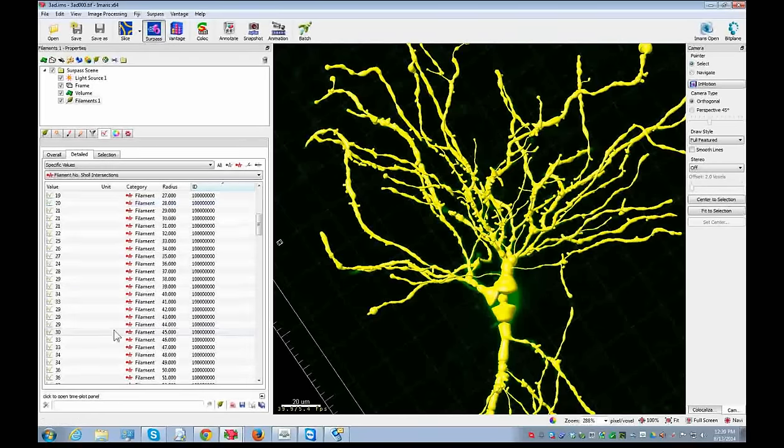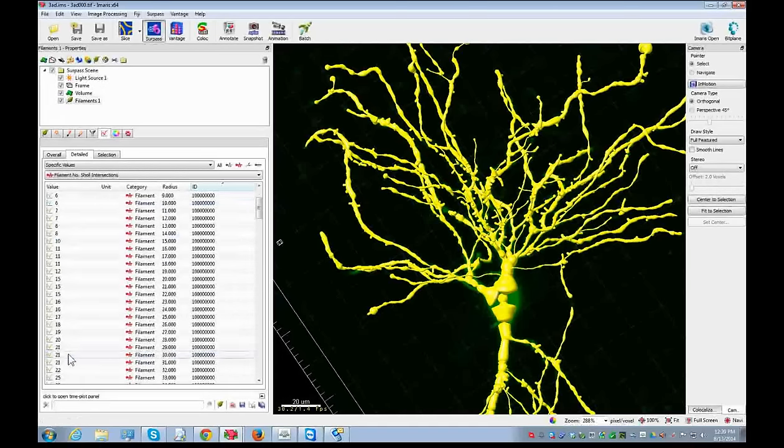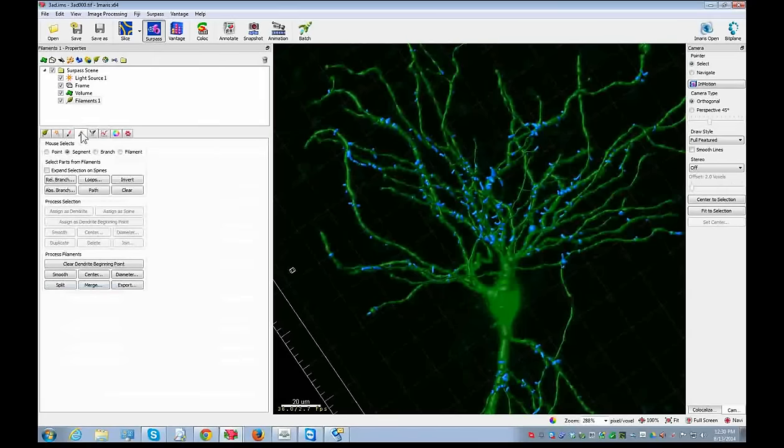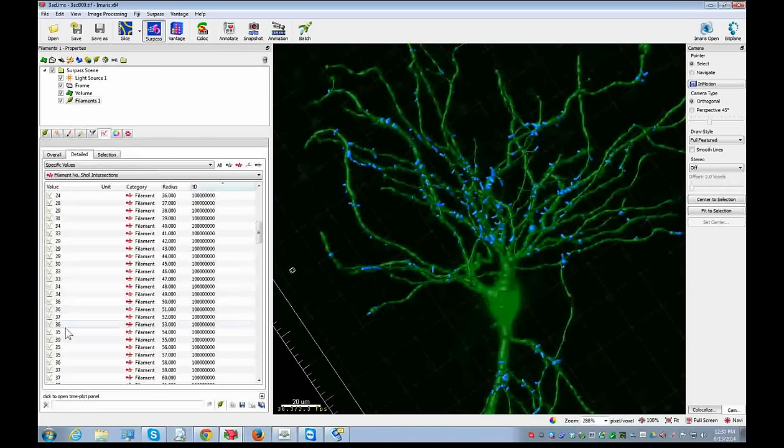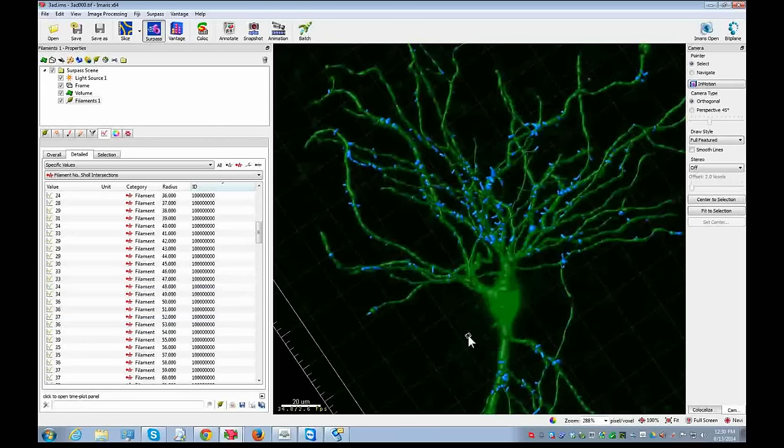but if we go and select something out like here, around 34, yeah, at the radius, I'm sorry, the radius of 48 should show you all of them. One thing I can do is highlight just those. I can do a mouse select point, and this should actually select just those points at a particular distance. And it's selecting everything. Okay, well, made a mistake.